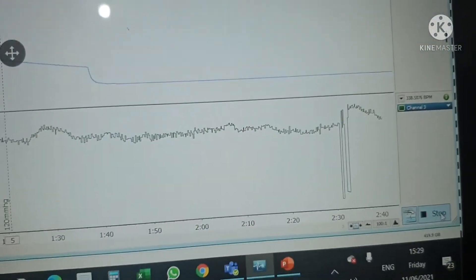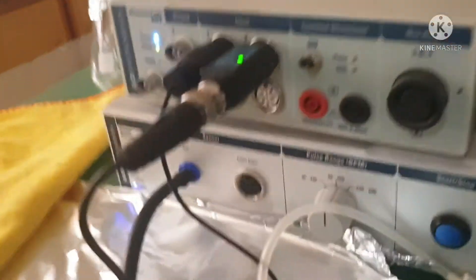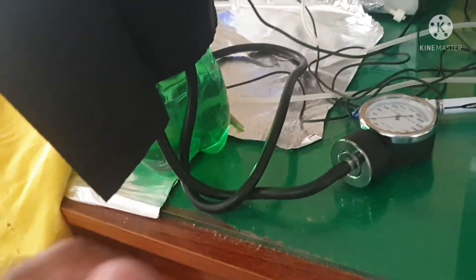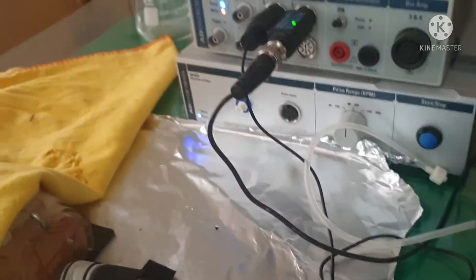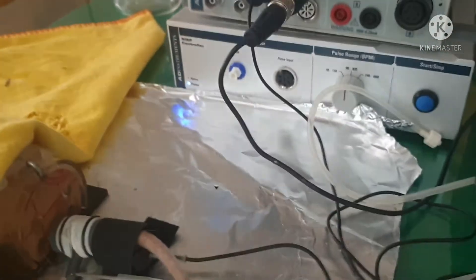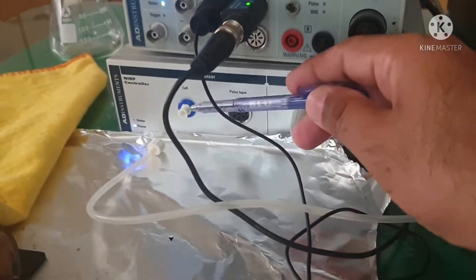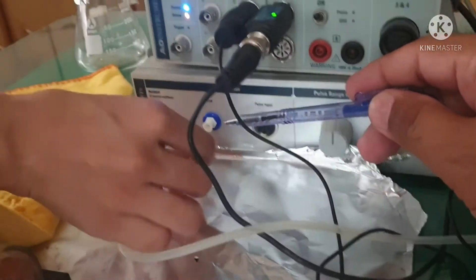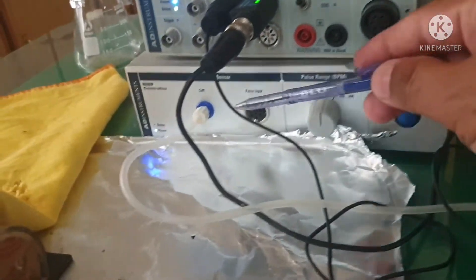Now we are going to stop the recording, and now we have to remove the BP cuff set and couple the system back with the pump system. My student is now going to reconnect the system to the experimental animal's tail.